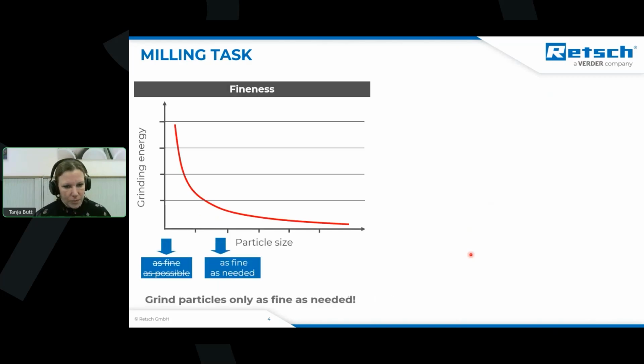Let's come to the fineness. A lot of customers tell us, I grind as much as possible and as fine as possible. Yeah, you can do this, of course, but it takes time. The finer you like to get, the more time you need to pay. So when it is not required, why waste time?